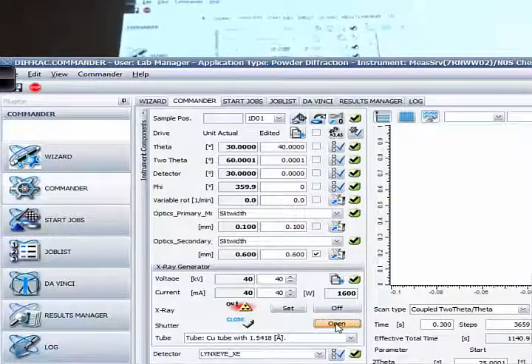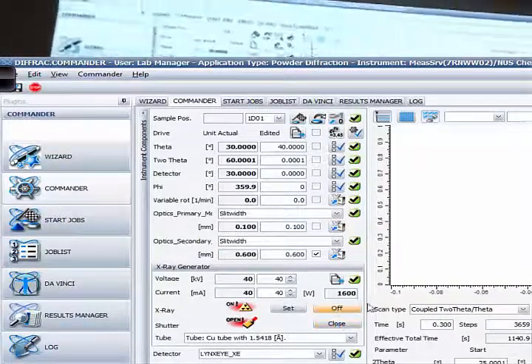40 kV and 40 mA gives 1600 watts. This is the X-ray on/off — you can also turn it off from here. This is the shutter — it's currently closed. Later when you're doing a measurement it will become open. I can open the shutter now — you can hear it clicking. It turns red in color. Now I'll show you: if I open the door immediately, the shutter cuts off. When you close the door back, the shutter turns back on — your measurement will resume from where it left off.